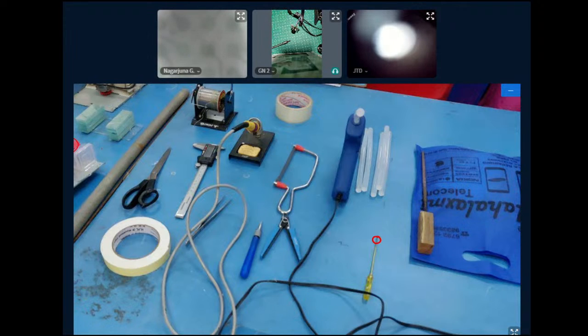DP, if time permits, I just wanted to show the setup of the lens, because people might be able to procure the laser pointer, if not the web camera, during the week, and they can post pictures. Yes. And update us next week.